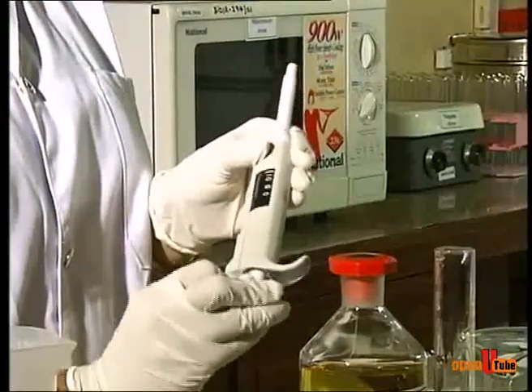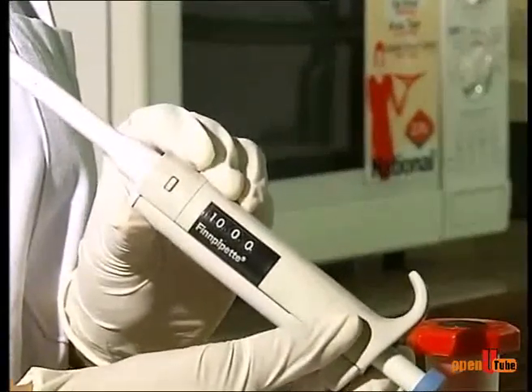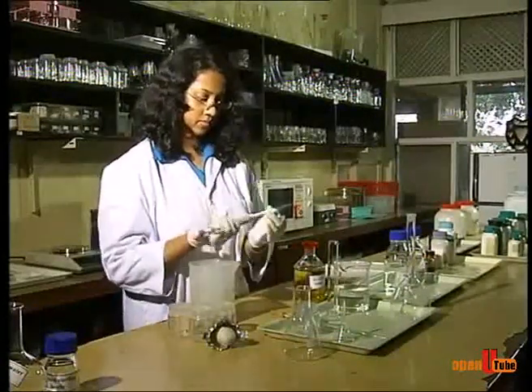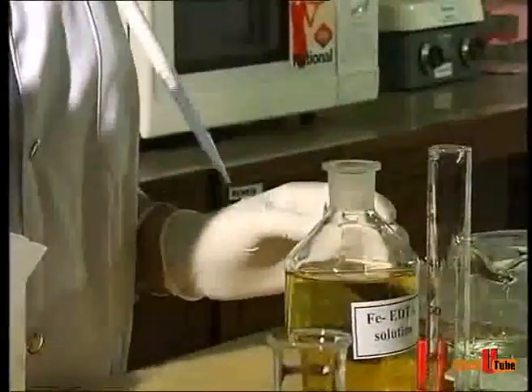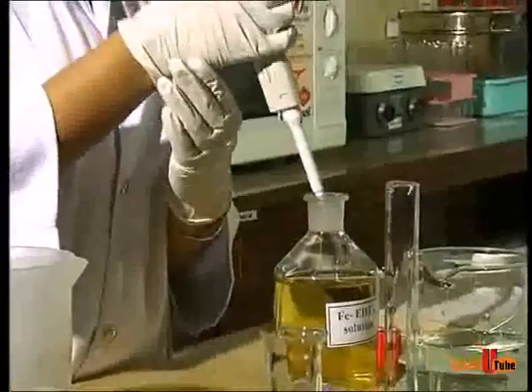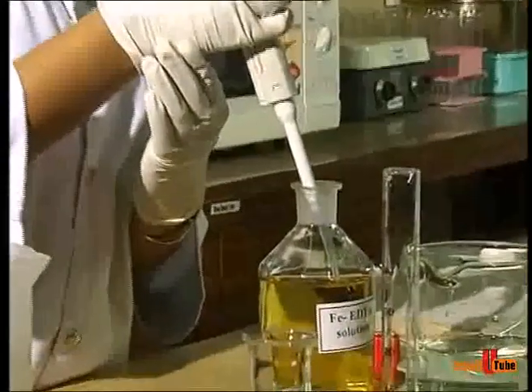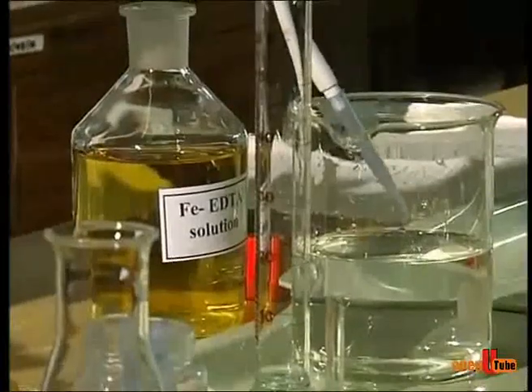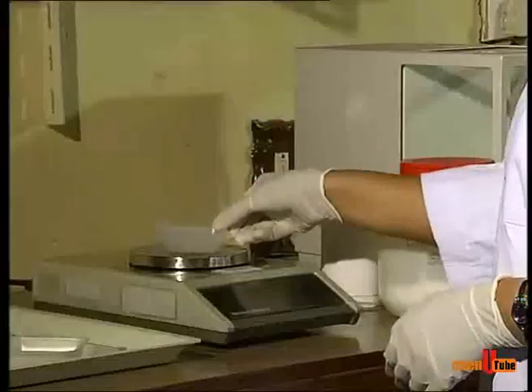In order to measure minute volumes, we use micropipettes. You can measure iron solutions with a micropipette. It is necessary to calibrate the micropipette before using. Measure the iron EDTA solution and transfer it to the same beaker.